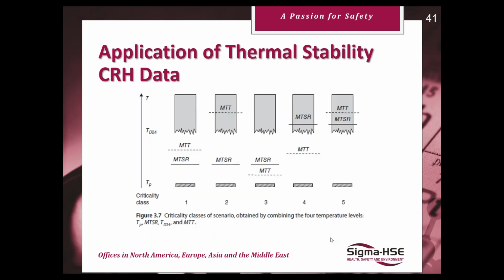So these can be classified under several different classes, which is all based on what's the theoretical maximum temperature of your desired reaction, what is the maximum theoretical temperature of your system based on boiling points and containment of the reaction mass, and what kind of temperature you might start triggering decompositions. The combination of those will define the reaction into different criticality classes.